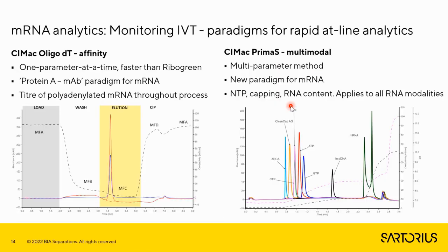In order to monitor and in order to optimize this relatively expensive chemical reaction, it is again our strong belief that we need to be keeping a very close eye on the reaction. And we see many different practices in the industry, from some pre-purification steps coupled with UV detection to no monitoring at all, in fact. But we've been working very hard on developing tools that could look again at the earliest time points of the reaction and resolve nascent RNA from the building blocks, because it's the NTPs that are being, if you want, stitched together into a chain.